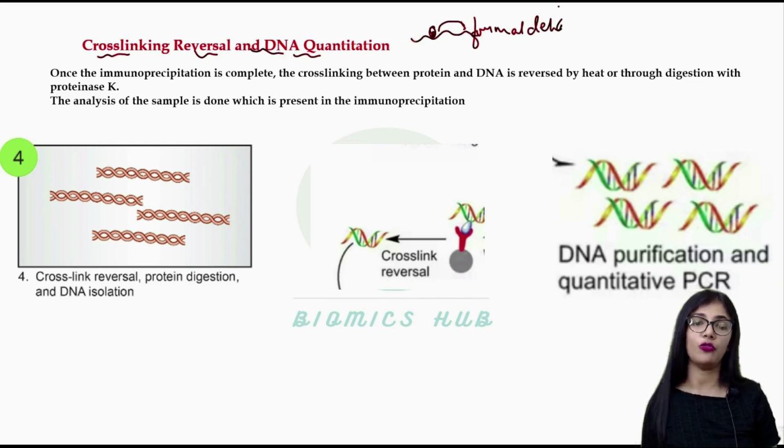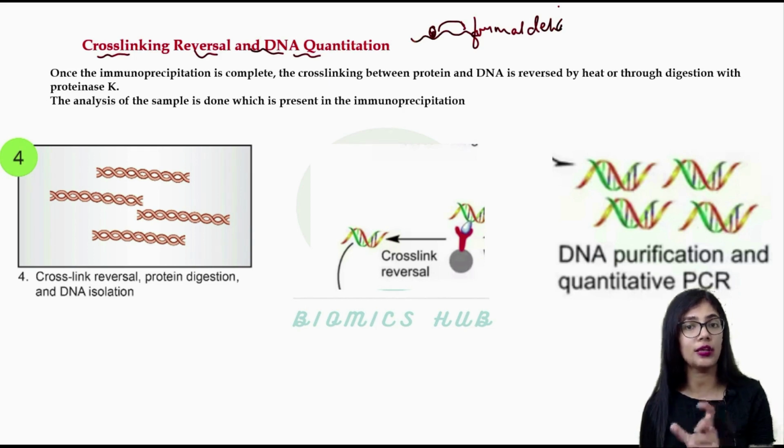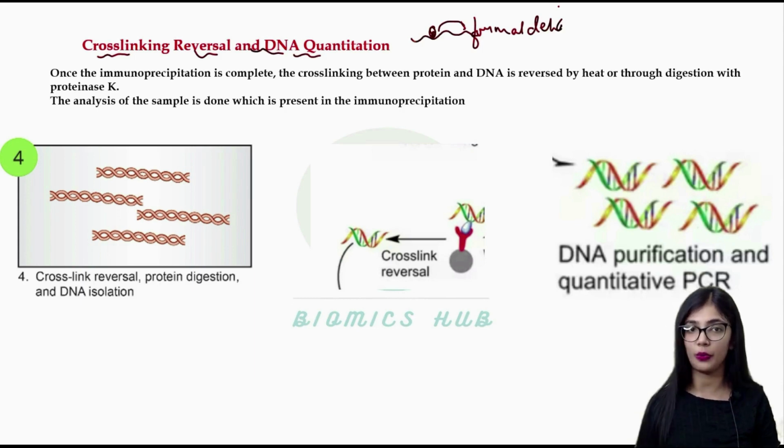Now, what we want to know is, if the protein is interacting with the DNA sequence, in which particular area it is coming and interacting. We have to know that. For that, what do we have to do? We have to do the sequencing.